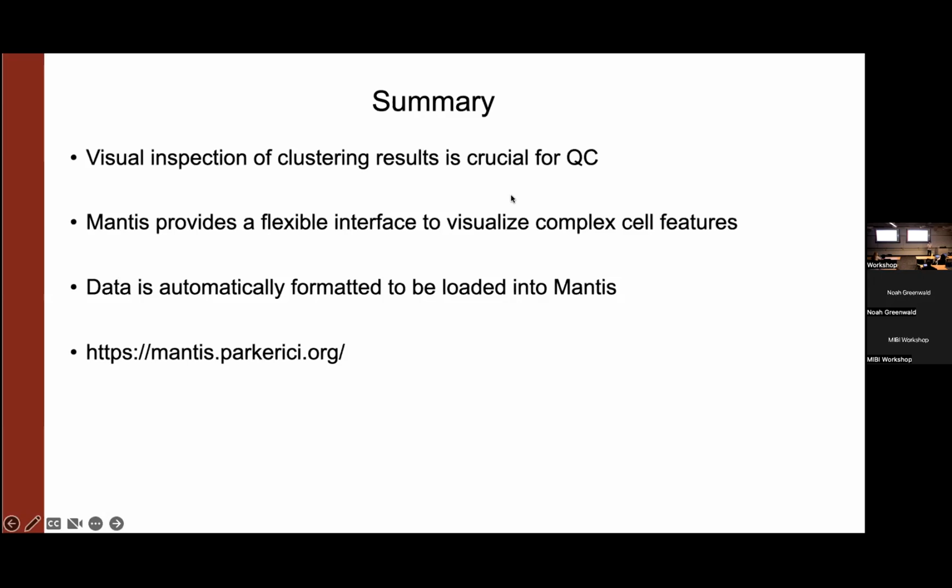This is one of the things with these larger data sets: pragmatically, the software is just not there. Maybe it will be good enough sooner or later, but if there's anything we saw when you did the training data for Mesmer, it's that 90% correct is about as good as inter-person agreement as you can even get.